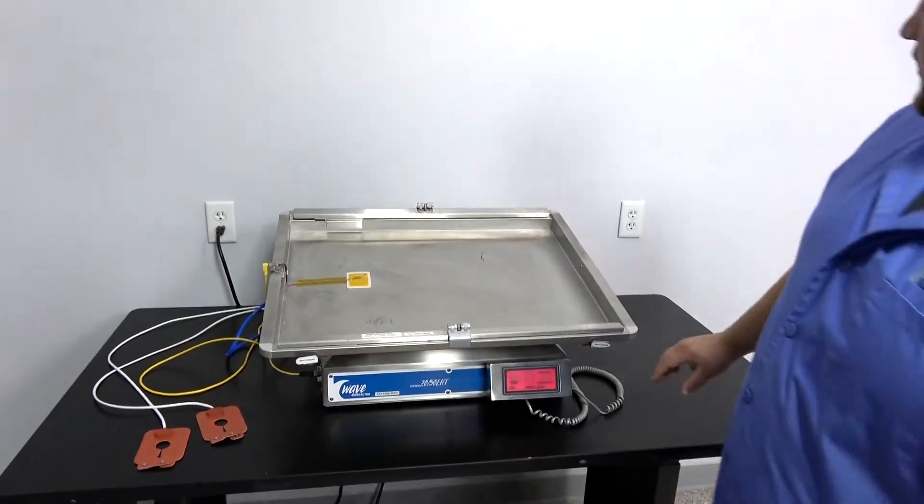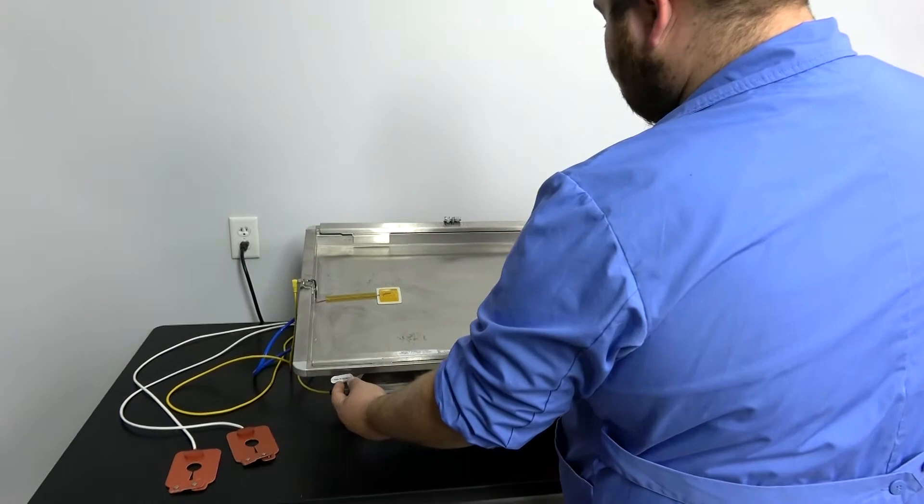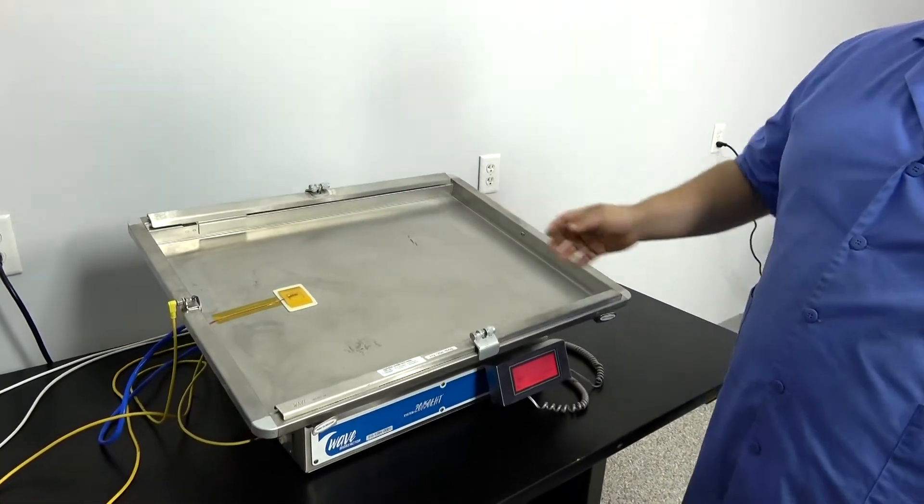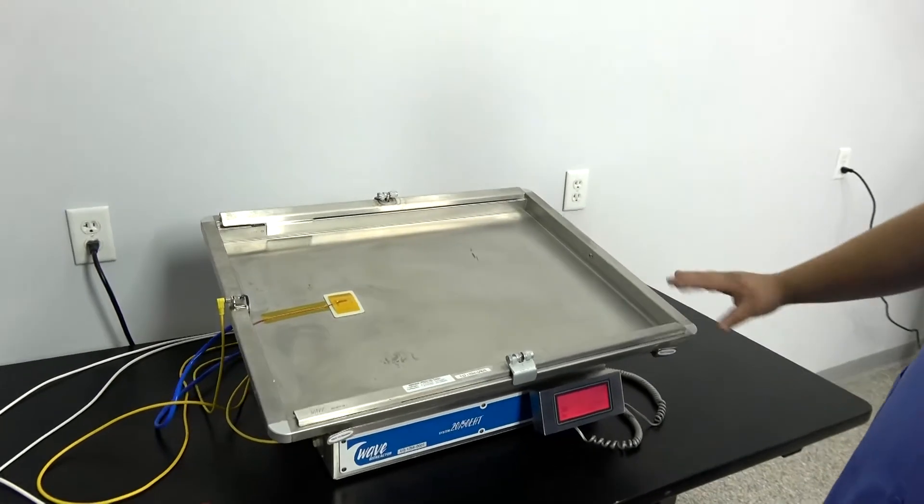The other nice part about this unit is if you push these two tabs here, this whole tray will pull off, and you can put in an incubator or anything that might suit your needs.